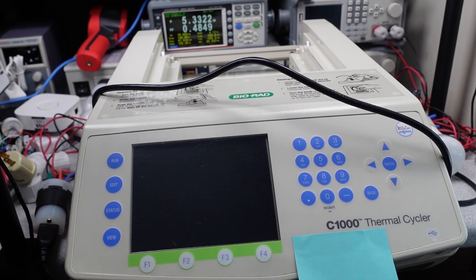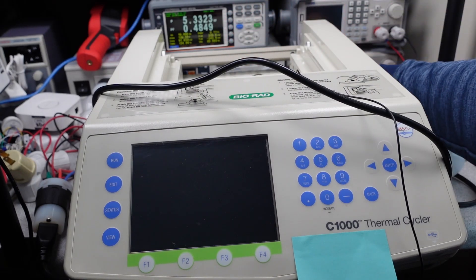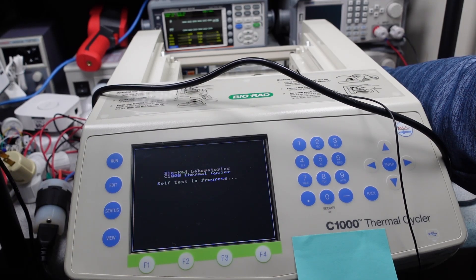Hello, today I have an electronics repair for the channel. This is a rather expensive and large piece of lab equipment used for biology. I got a quote to either buy a new one or repair this one, and wow, it's really expensive, so I decided to take on the challenge myself.